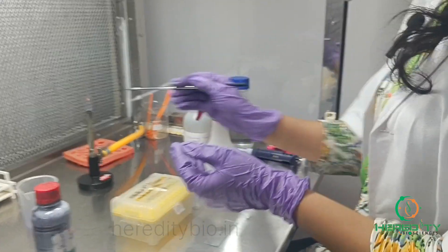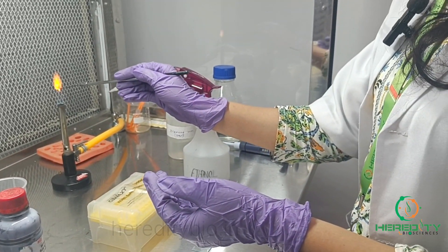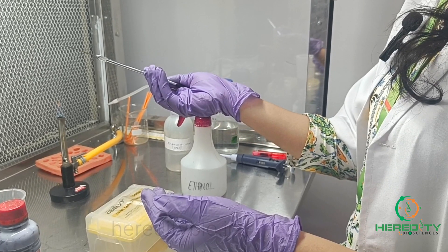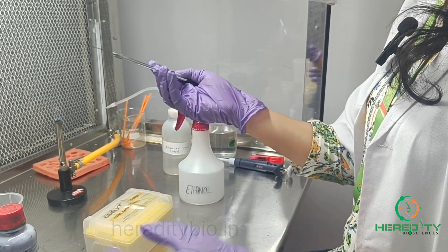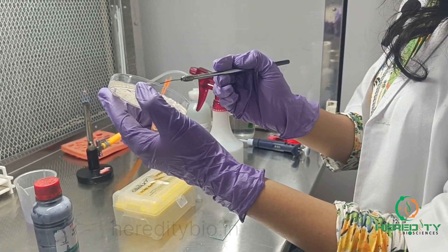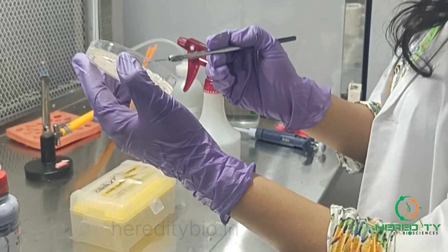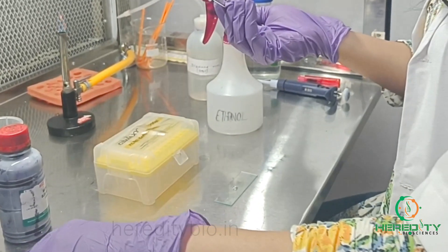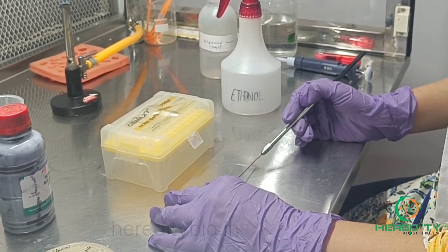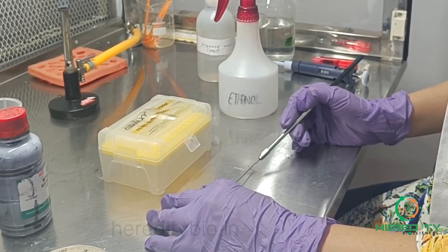Before using the loop, we'll sterilize the loop in the flame. Then we can take bacteria from the culture plate and prepare the smear where the saline water is being placed in a circular way.